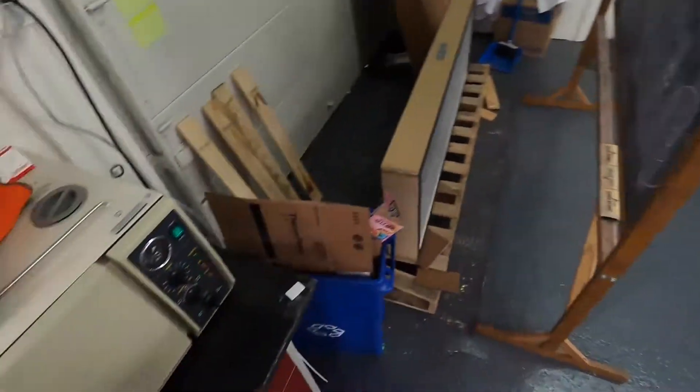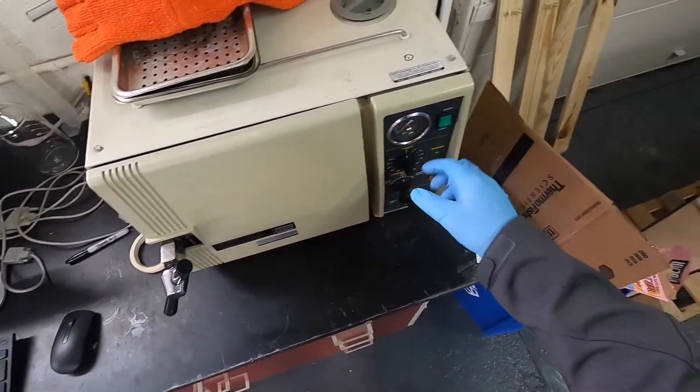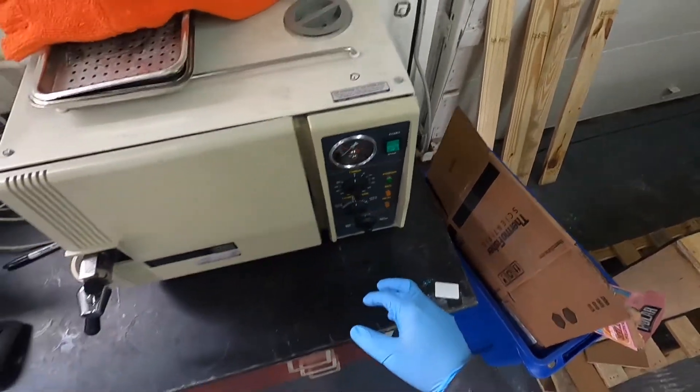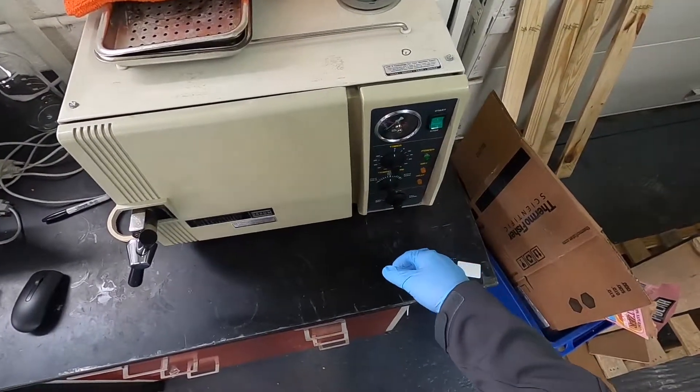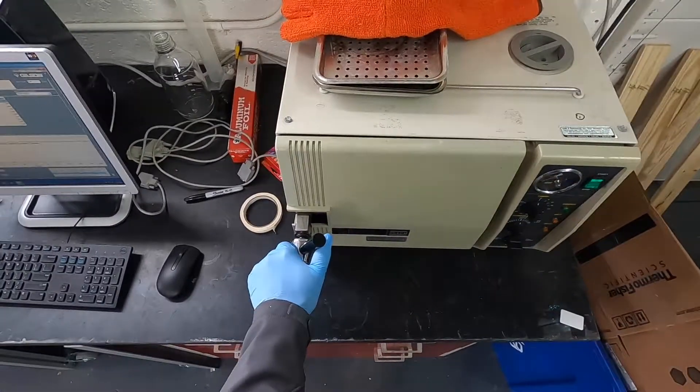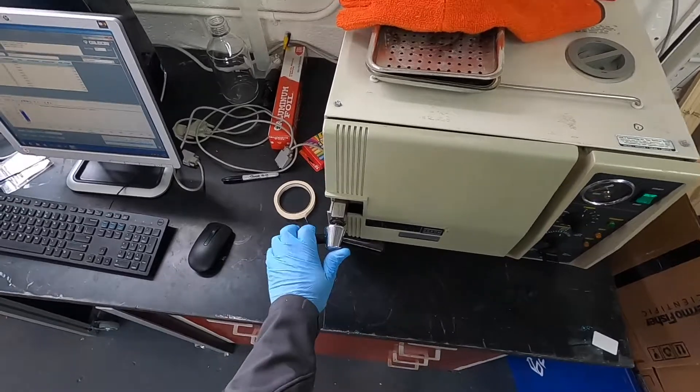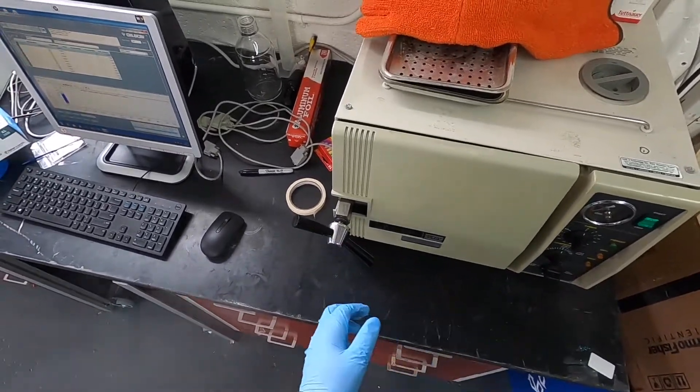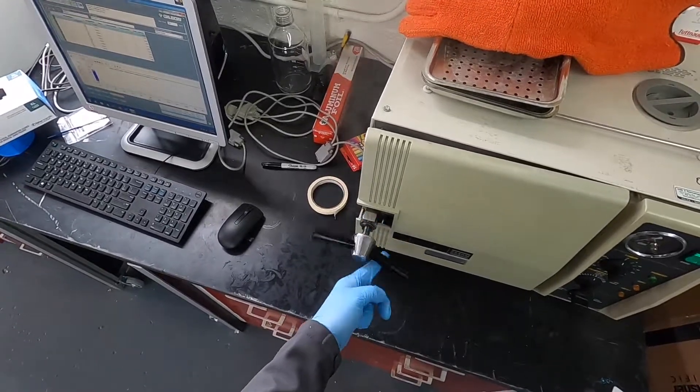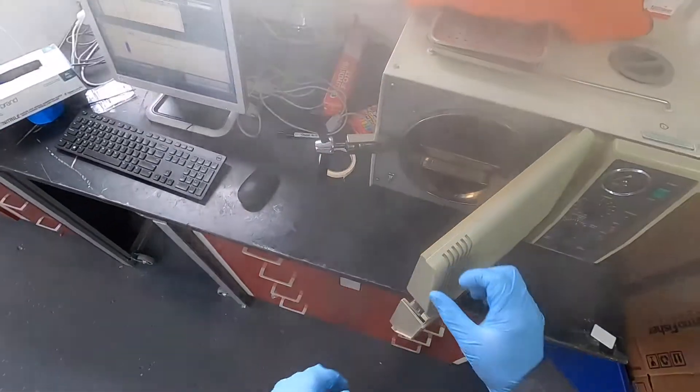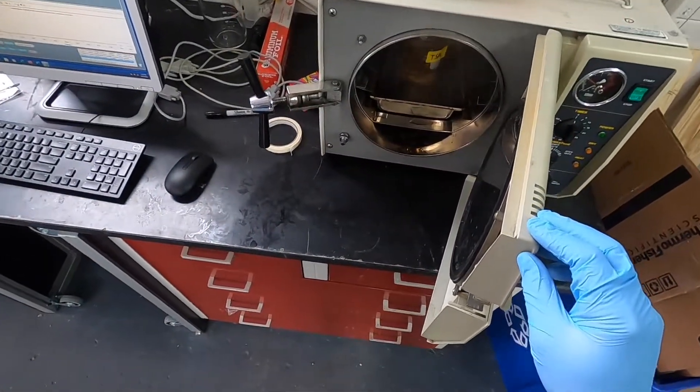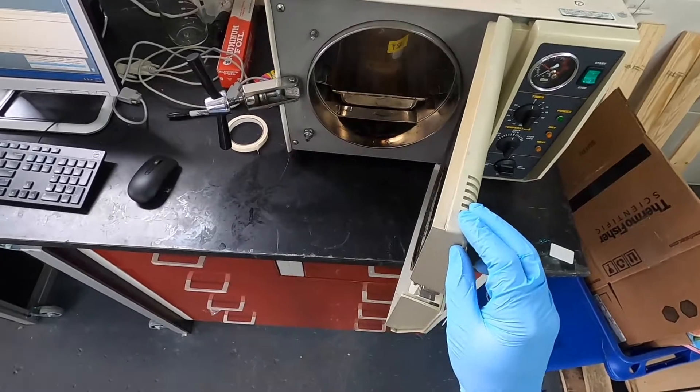So once the autoclave is done, it's reached one bar, 15 psi for 15 minutes. We exhaust it, just let some of the excess steam out. There's still going to be some in the chamber.